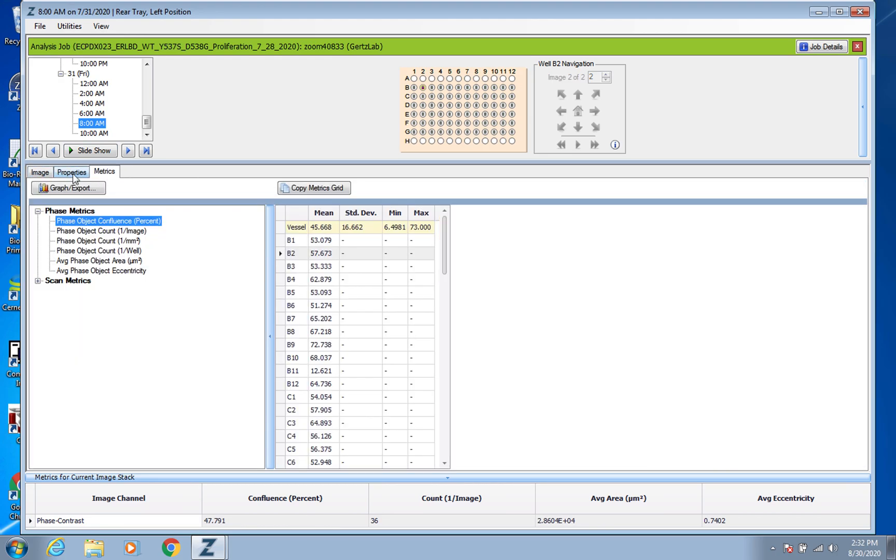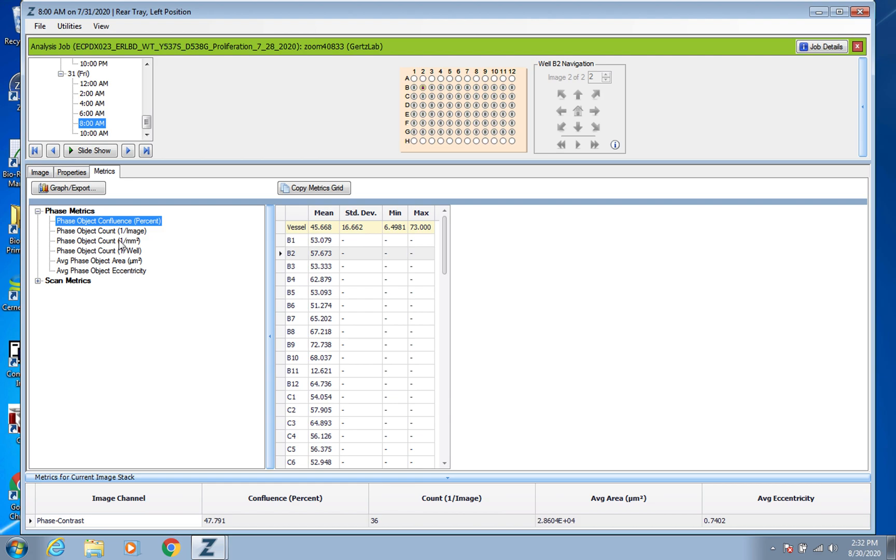So you can actually just glance down here for that sort of data. But mostly what you're going to do is go over to this tab Image Properties Metrics, you want to click on Metrics and you want to make sure it's clicked on Phase Object Confluence. That's the main thing you're ever going to use for this. These other ones don't end up being very useful at least for most of our experiments.